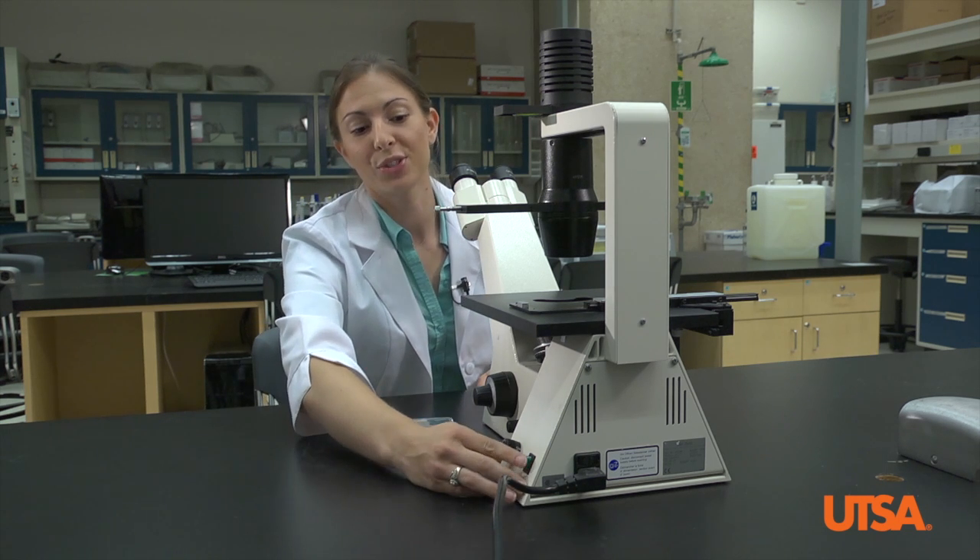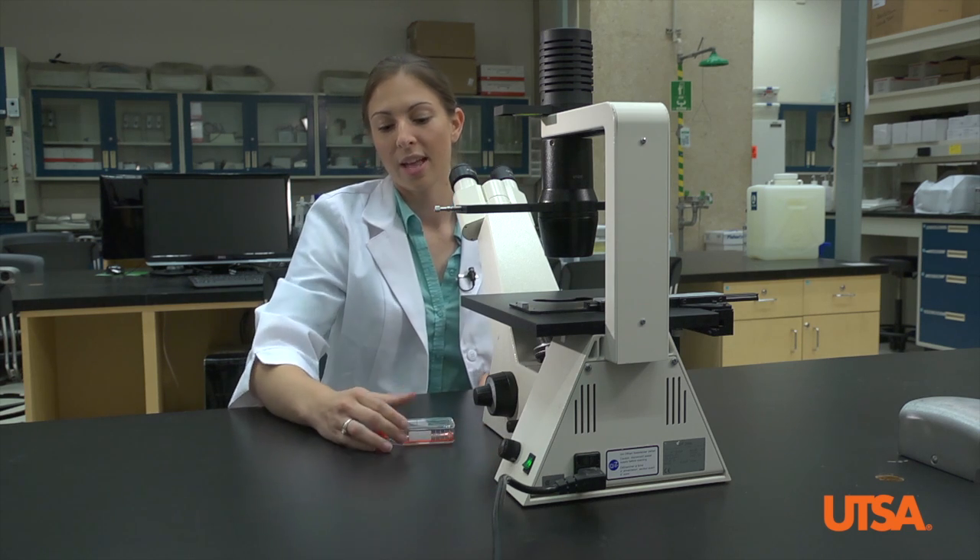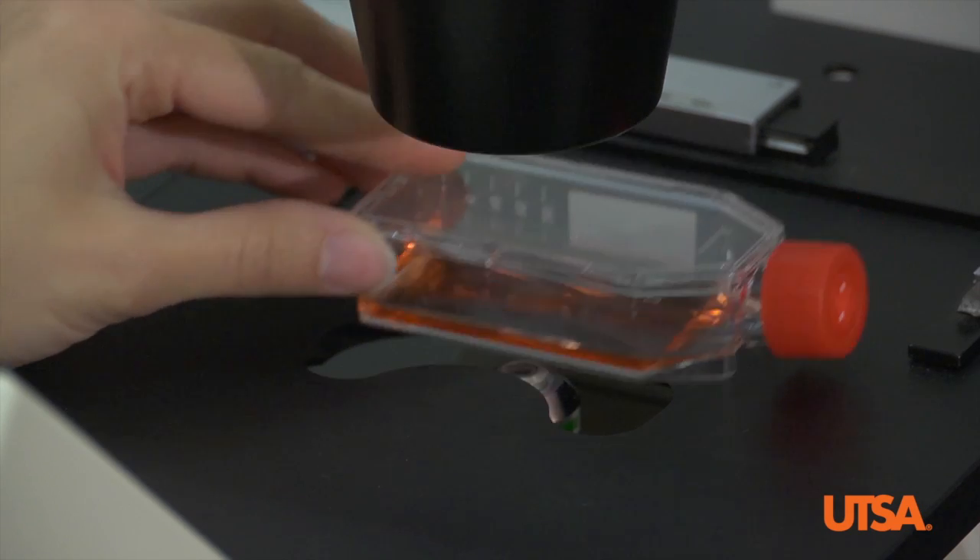The first thing you want to do is turn on the light source, adjust the light brightness, and place your cell culture flask on the microscope stage.